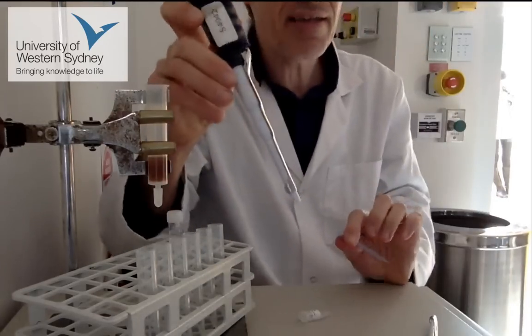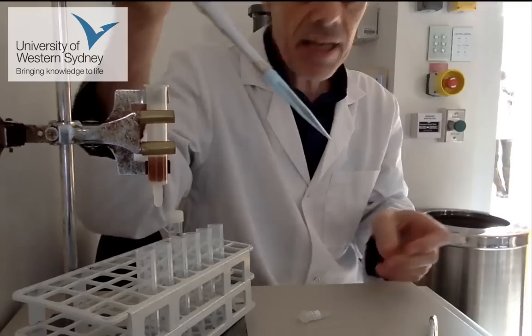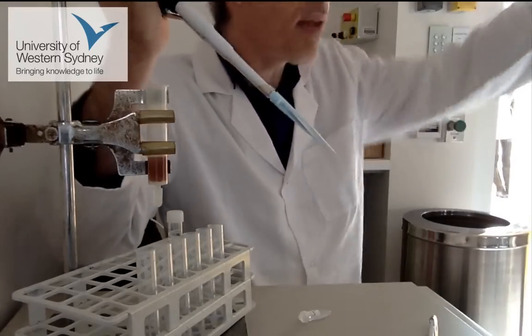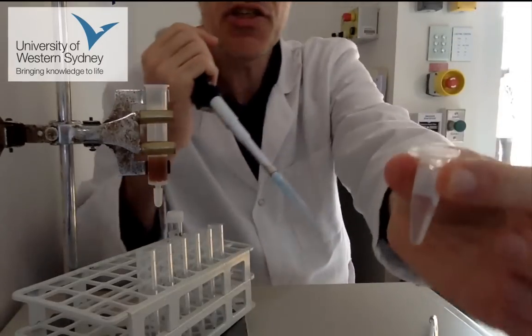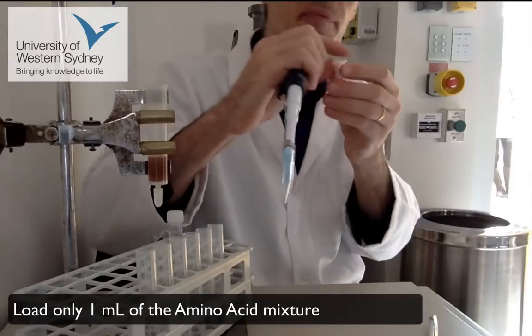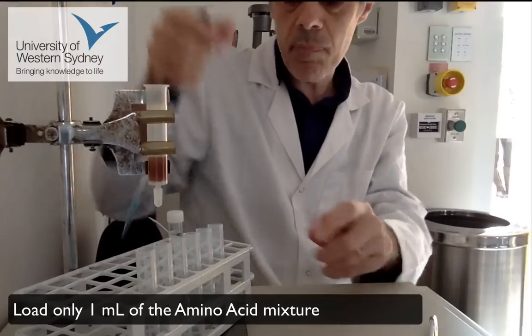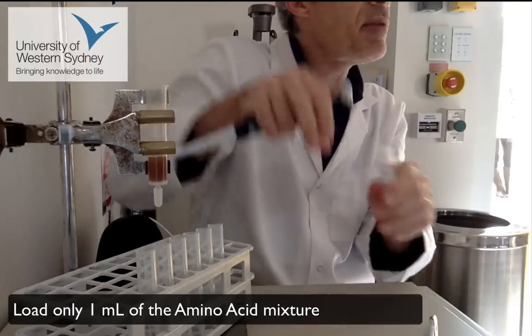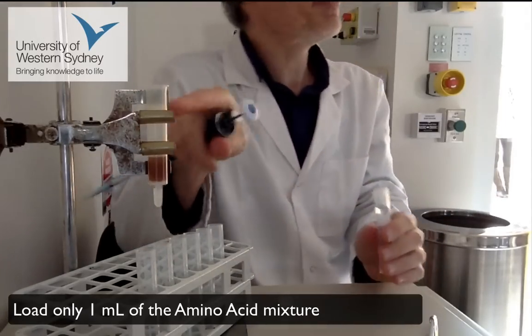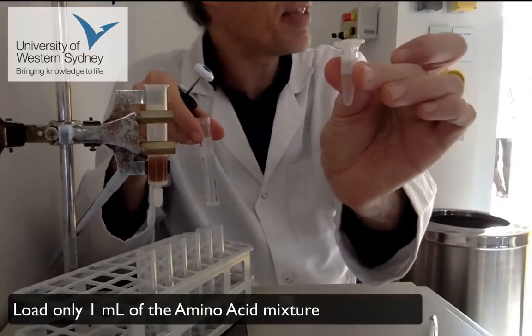you get the right pipette, make sure you've done your pipette license, okay? And this is set at 1 mil. There's also some plastic loading pipettes you can use. This is your unknown amino acid, okay? You just load this amino acid. Now, when you're loading it, I'm going to load a bit of buffer rather than amino acid simply because I want a student to be able to use this and I don't want to contaminate it. But what you would actually load is your amino acid sample.